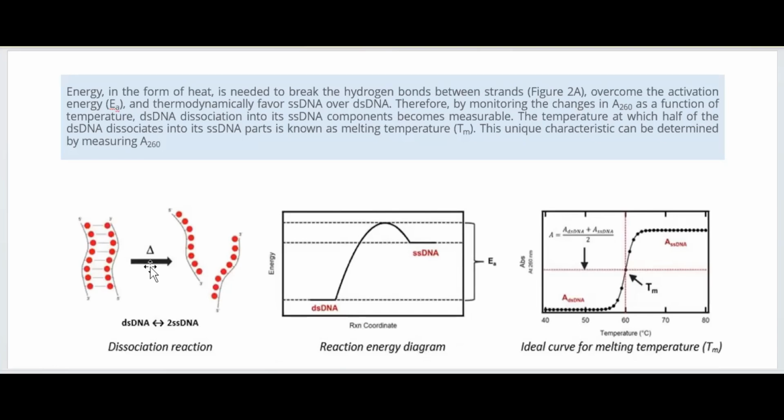More the absorbance indicates more is the concentration. So as you go on increasing the concentration of analyte, the absorbance value for the analyte will go on increasing, and you can get the proportionate increase in the absorbance values. So for the unknown sample with the analyte, you can have a standard graph initially prepared with the known concentrations versus absorbance. That graph is prepared, and the absorbance of your sample analyte is measured, and you are going to use the standard graph for finding out the relative concentration of your analyte under study.